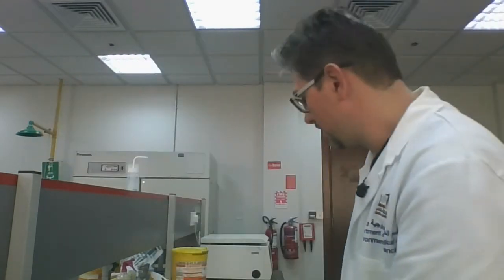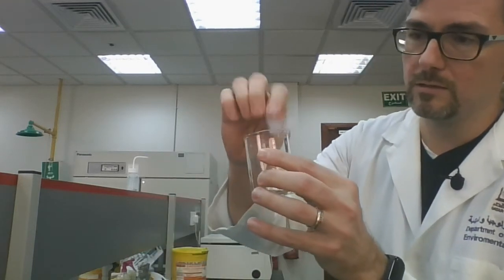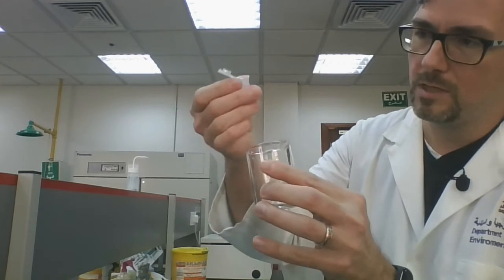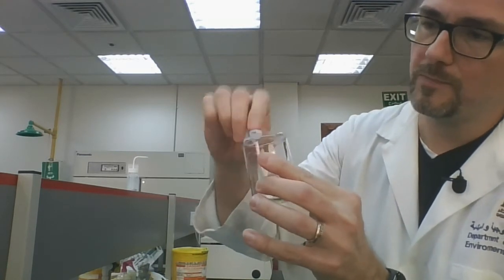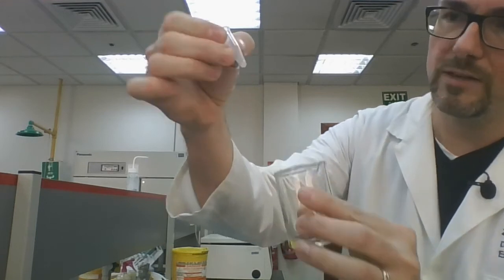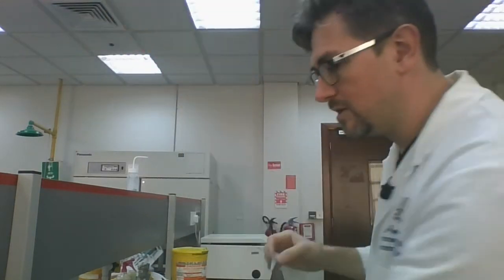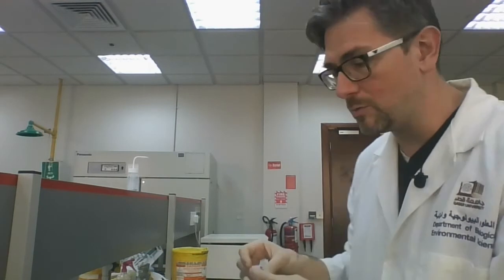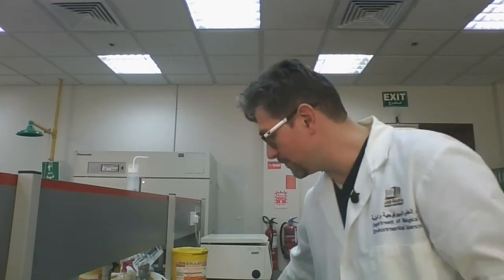Okay, so I'll do that with the second one as well. Again, just open it up and dump it into my waste beaker. Again, don't be afraid to tap it out. Remove as much of the liquid as you can. Okay. And so what we're left with is really just the cells themselves. There's a little bit of liquid in there. You don't have to worry too much about removing every single little bit. It's nice if you can, but in the interest of time, we're going to move on.